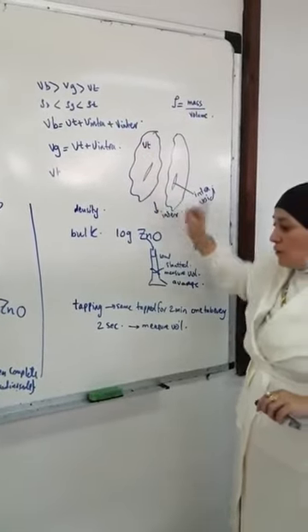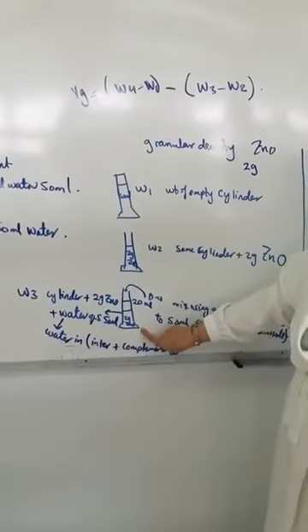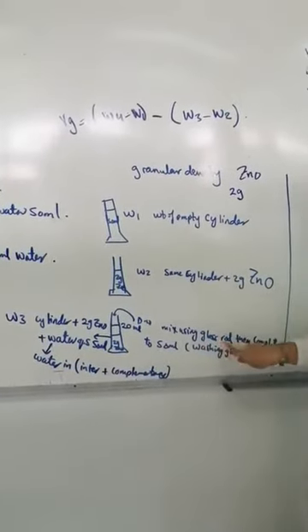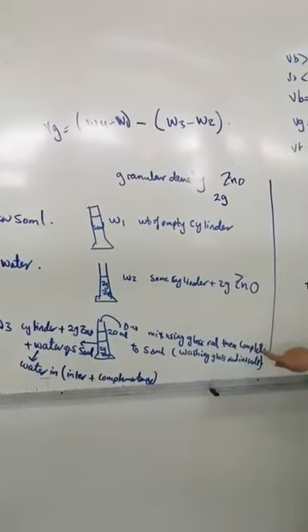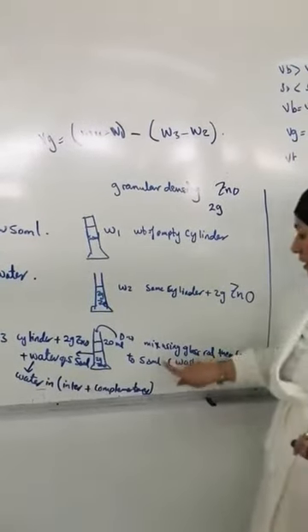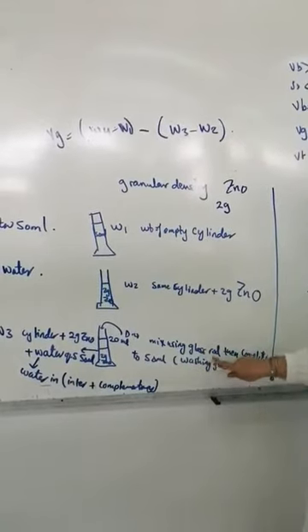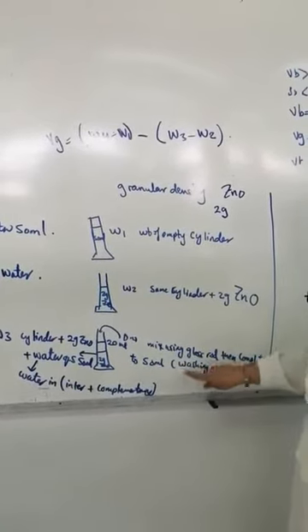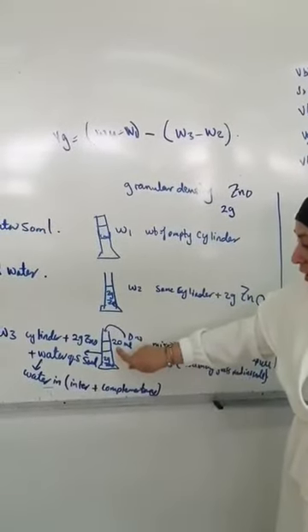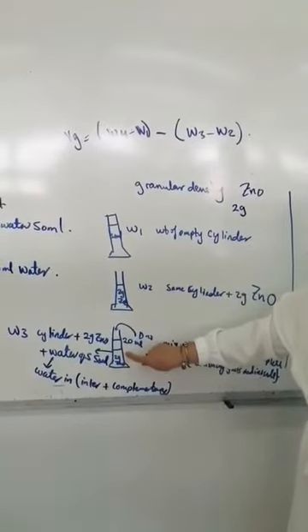So we add water up to 20 ml using the glass rod, enabling the water to enter the intervoids. Because the glass rod will retain some of the zinc oxide powder, we have to rinse it and wash it above the cylinder, and all the powder must re-enter the cylinder.